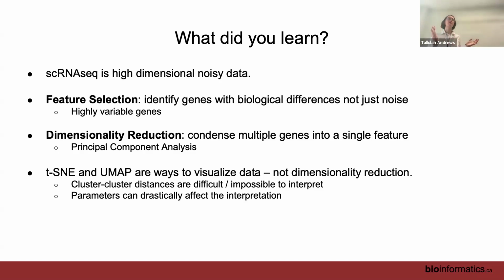Since about 2019 or so, people realized that this was the problem, and t-SNE from packages that were updated after 2019 now uses the same starting point as UMAP. So it uses the first two principal components, and now it's just as reproducible as UMAP, and just as good at making a visualization as UMAP. So that's why it was believed t-SNE has reproducibility issues, but that's no longer the case.